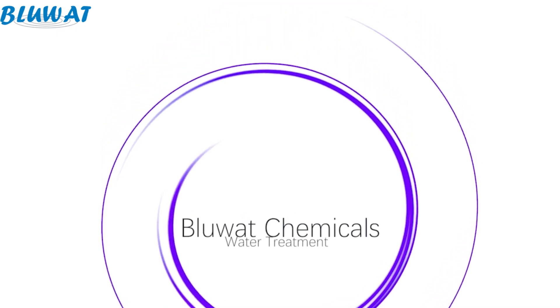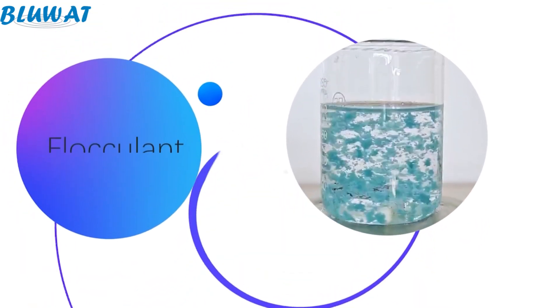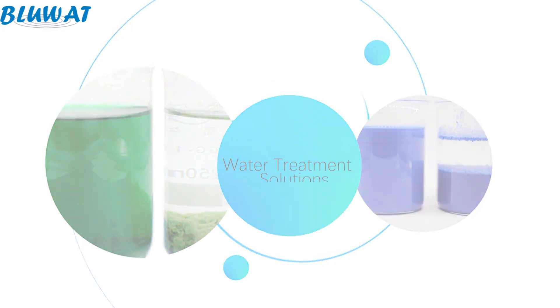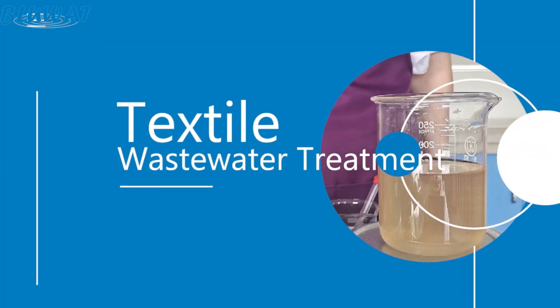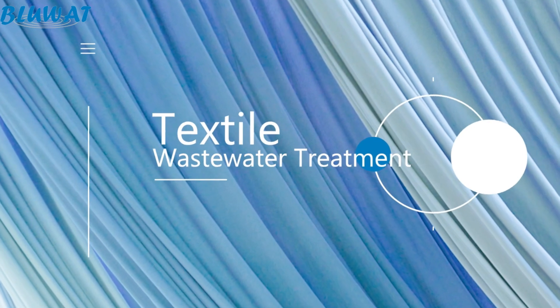Hello everyone, this is a video from bluwat.com. This channel is for people who want to know more about coagulants and flocculants. In today's video, we are going to show you a wastewater treatment jar test. The wastewater is from a textile dyeing and printing factory.